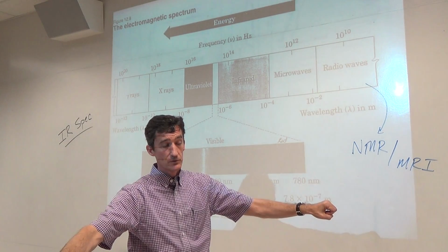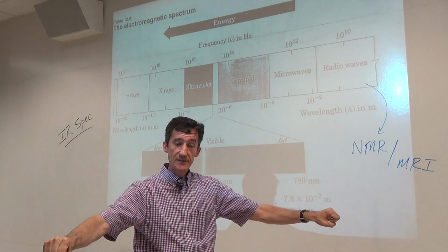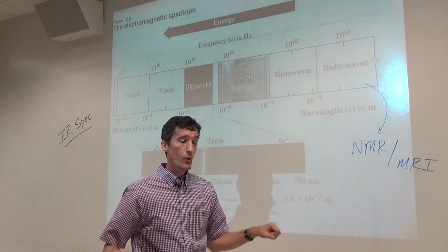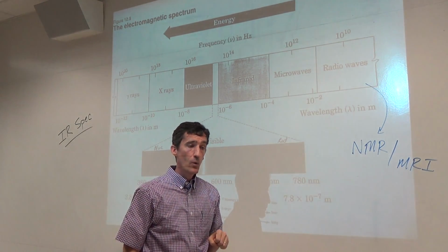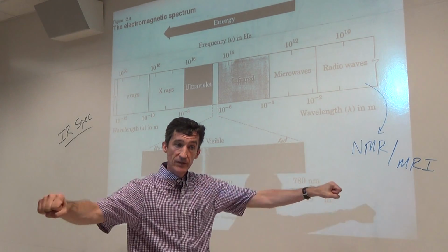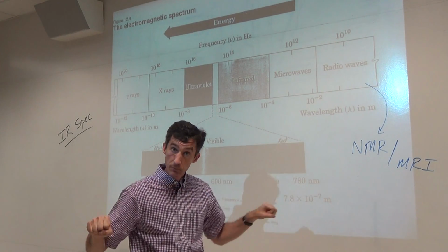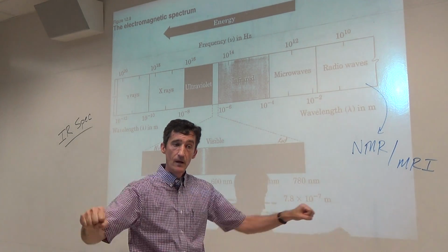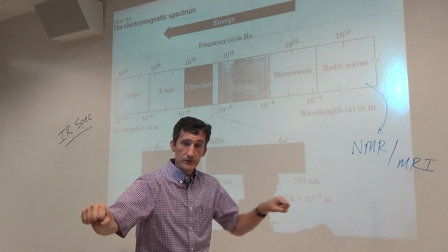And in some molecules, the absorbance can occur when it matches this frequency, or the absorbance can occur when it just matches that frequency. This one is called a symmetric stretch, symmetric 2-bond stretch. The alternative to that is an asymmetric 2-bond stretch.